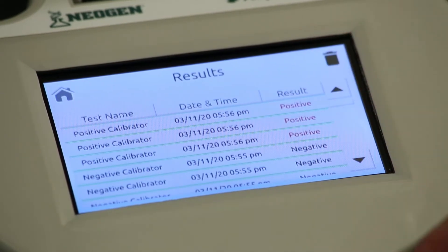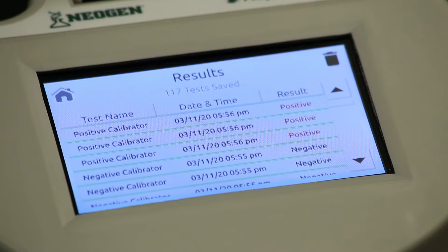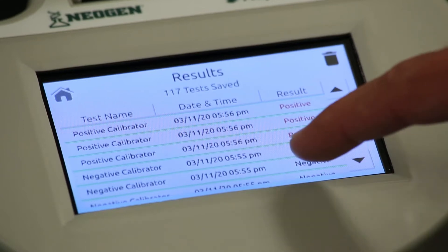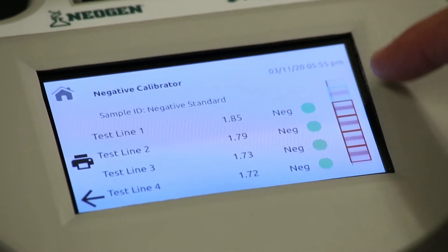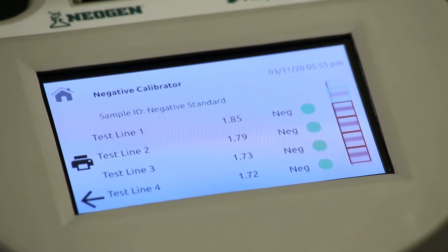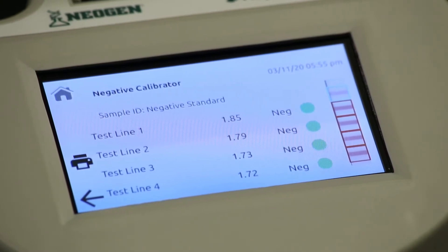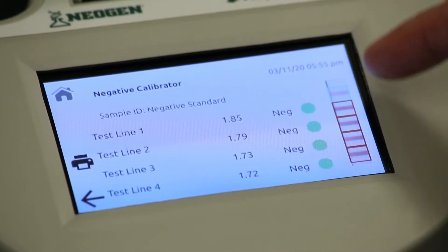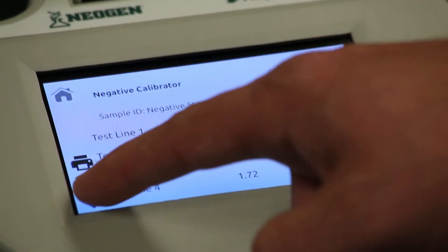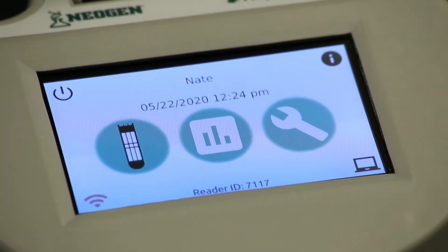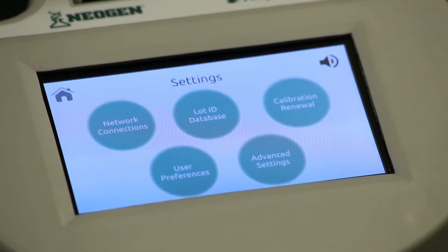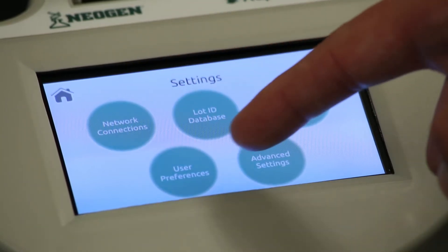The current date, time, and reader ID are also displayed on the home screen. Touching the results icon displays all stored results on the reader. The reader can hold approximately 2,000 results and notifies the user when nearing capacity. A summary displays for each result. Selecting a result brings up a screen that provides the ratios or quantitative result and a photo of the developed test strip. Press the print icon to print the detailed results screen, or press the home icon to return to the home screen.